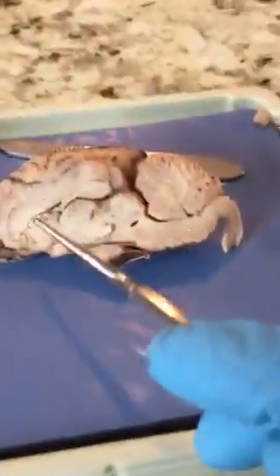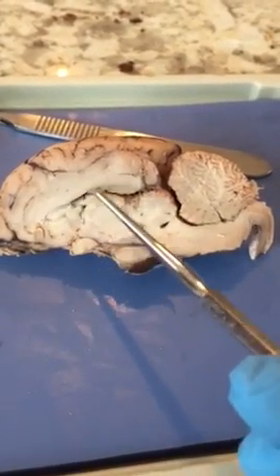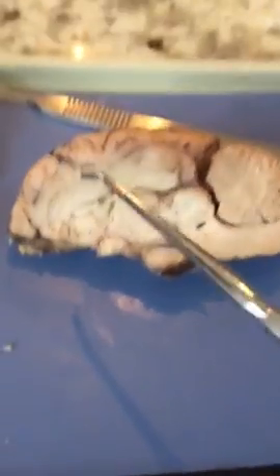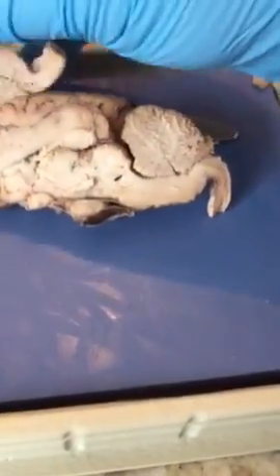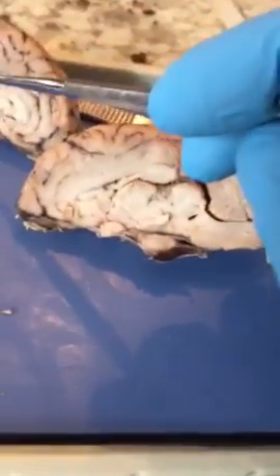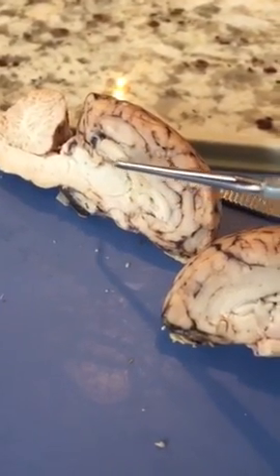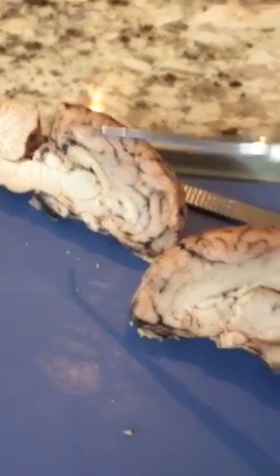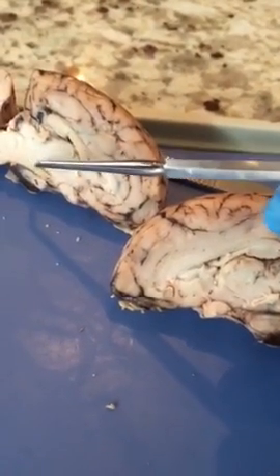The mid-sagittal section, the corpus callosum is located right in here. The thalamus, this one's better. The thalamus is this round area of tissue right here. The hypothalamus is right down below it in this area.